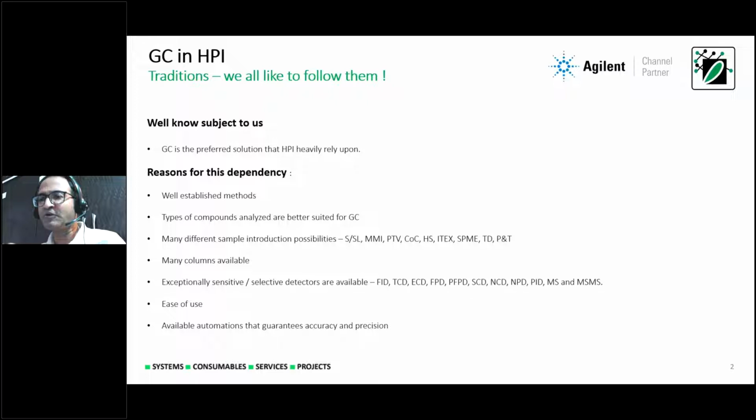Sampling valves. Like GSV, we have the LSV also. So the liquid also allows. Besides that, the liquid auto-samplers are available and they are exceptionally precise, and therefore, when it comes to the relative standard deviation, for example, the relative standard deviation of area, we actually can really rely upon the modern systems.